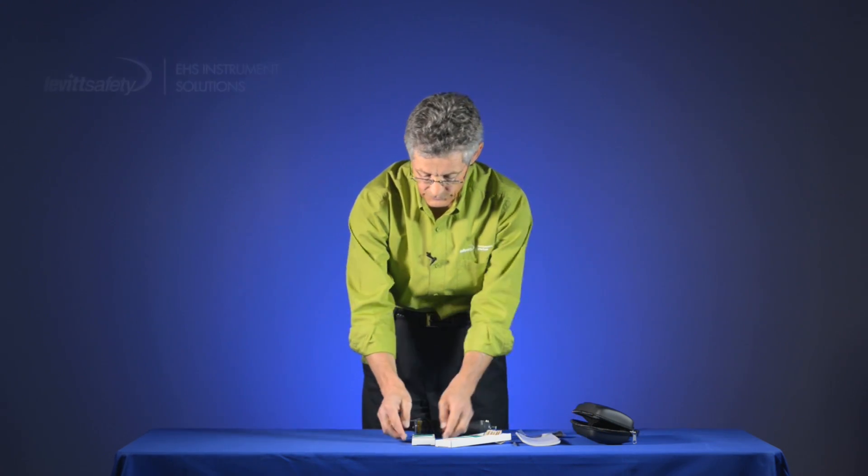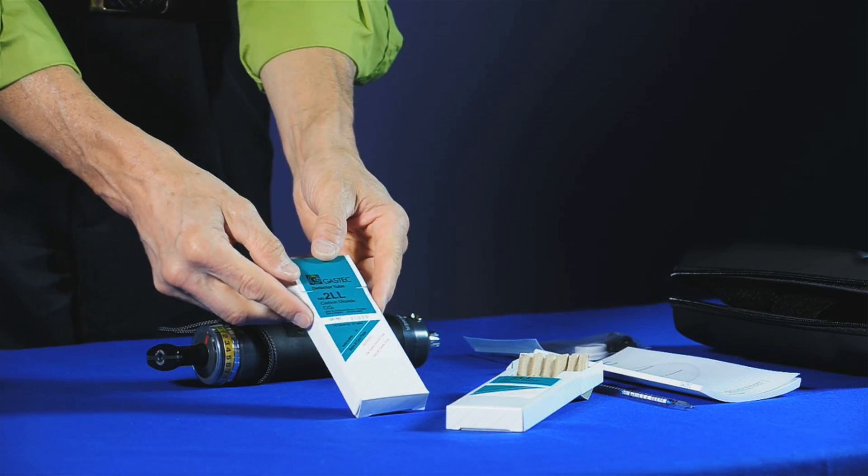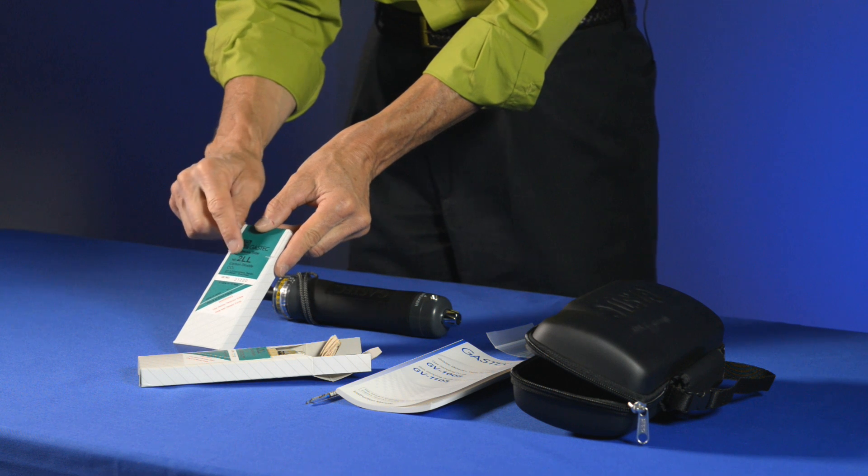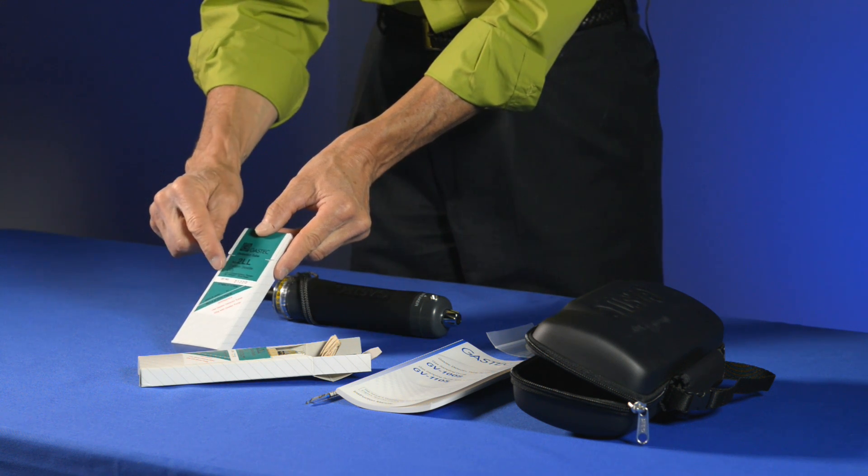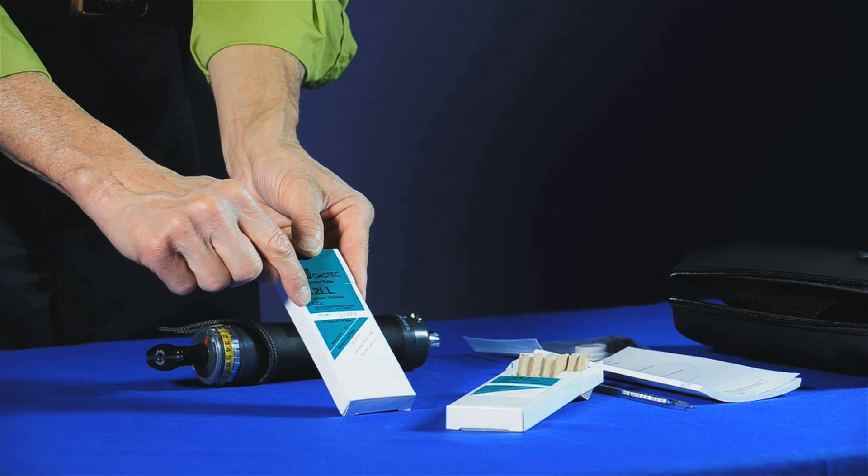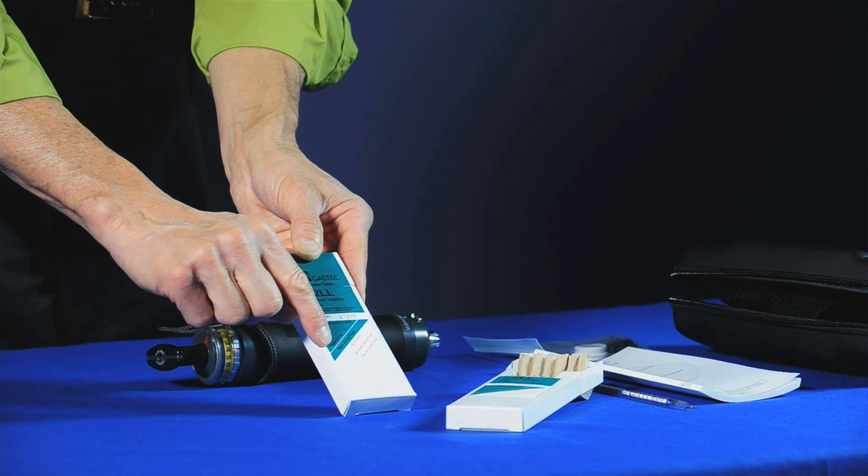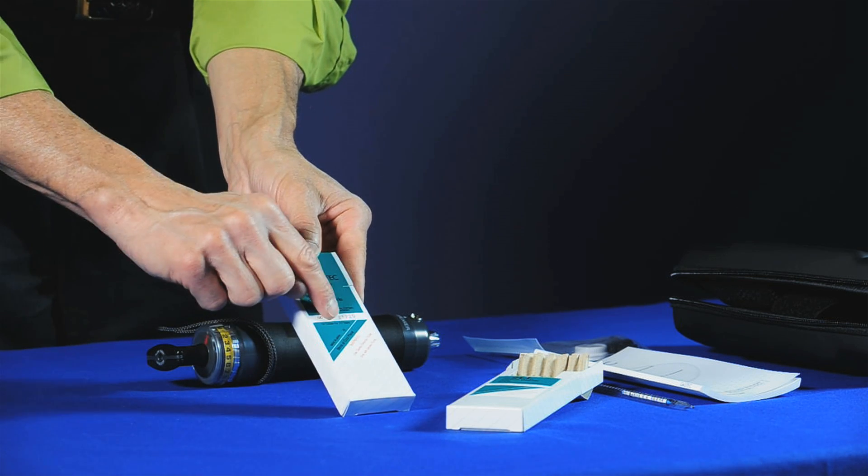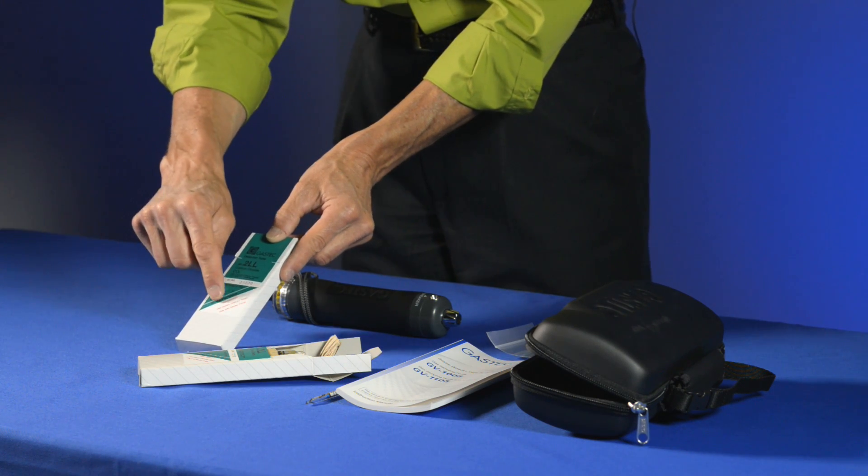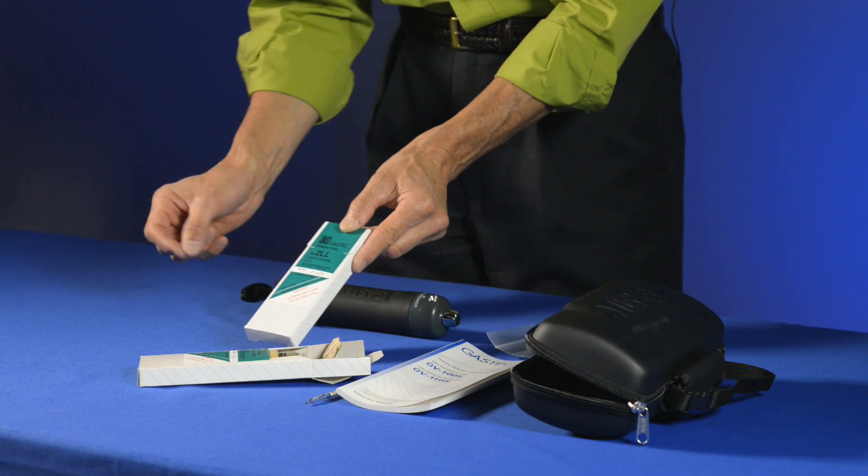So the other part of the system, of course, is the boxes of tubes. And like I mentioned, there's over 500 different ones. We're going to use carbon dioxide today, a number 2LL tube. You'll notice on the front of the box it says the range of the tubes and the gas we're measuring. It tells us to store it in a cool place, that there's 10 tubes for 10 tests in the box, and a warning from GasTech that these tubes are pre-calibrated for use only with the GasTech pump.